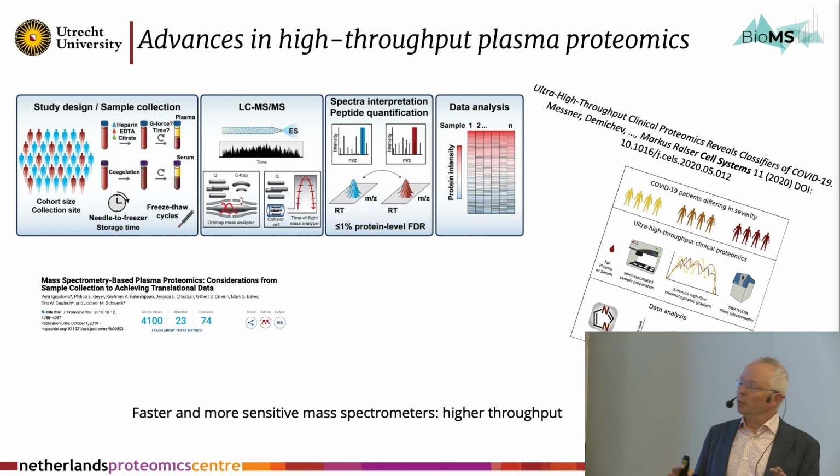Now, you can say, why do you want to do this? Now, yeah, that means that you can really do multi-assays on any biomarker in your blood and directly monitor if something goes up or down. And in this way, you can maybe see how we respond to drugs or how we maybe have a time point of inflammation. And this is really now booming, and a lot of research groups are doing this sort of efforts, this blood-based plasma proteomics.